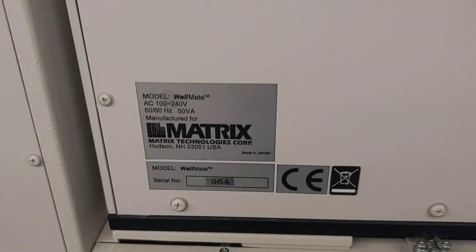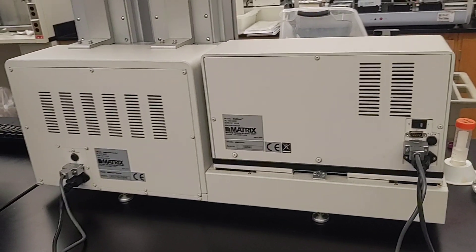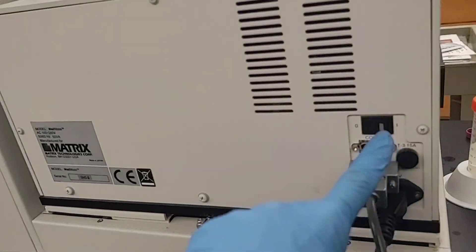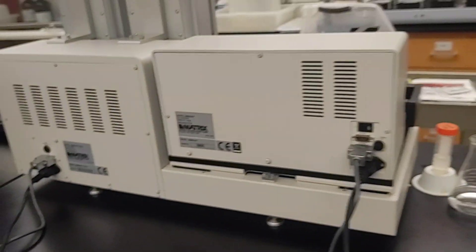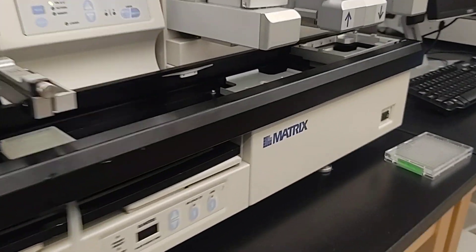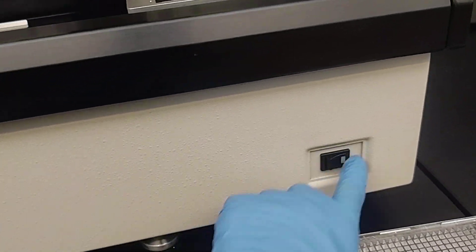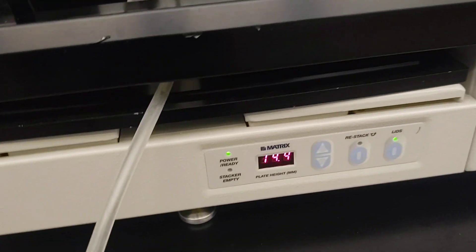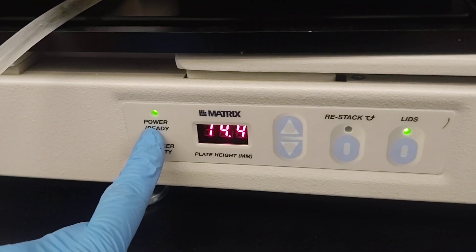We're going to be using the Matrix Wellmate. It's a liquid dispenser and we start by turning it on. This is the back of the instrument. Come around to the front and turn it on over here and you can check at the bottom here that it's on.